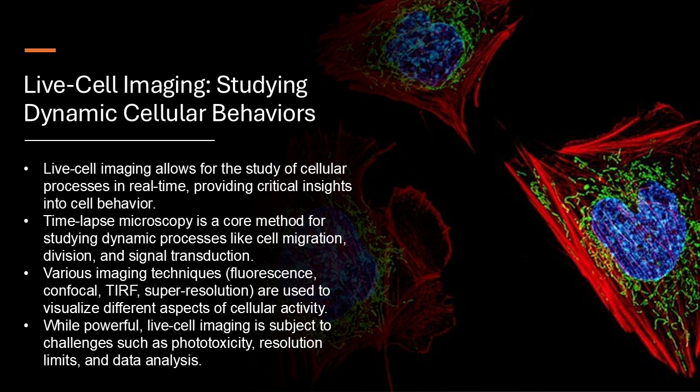I think we are. What other areas hold promise for live cell imaging? Well, another area that's really intriguing is the potential to use this technology to study how cells age. So we could actually watch the aging process unfold at the cellular level. Precisely. By observing cells over time, we could gain a much deeper understanding of the molecular mechanisms that drive aging.